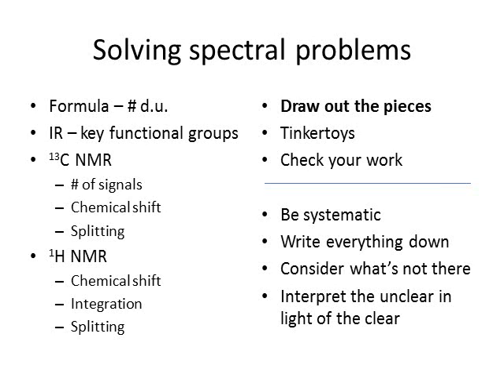Start with the stuff that's totally unambiguous, and then see how the more equivocal data fits into the picture shown by the very clear data, rather than trying to start with the confusing signals and then come up with a proposal and then try and fit everything into that proposal, whether or not it truly fits. Always start with the things that are obvious and then come to the more equivocal things.